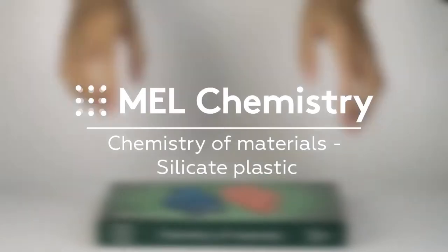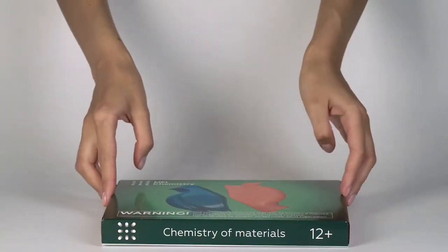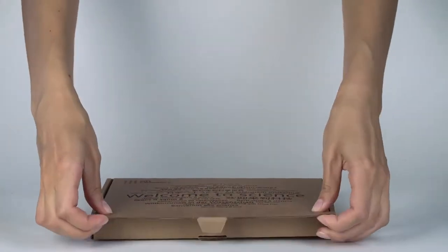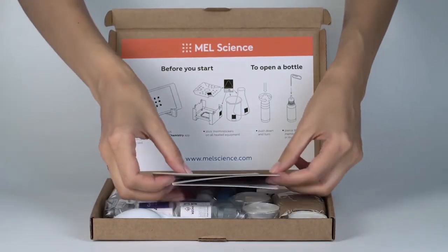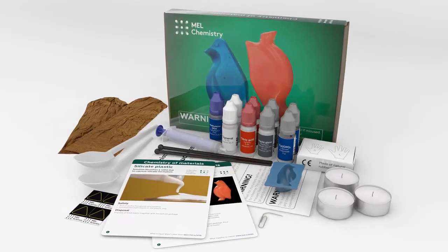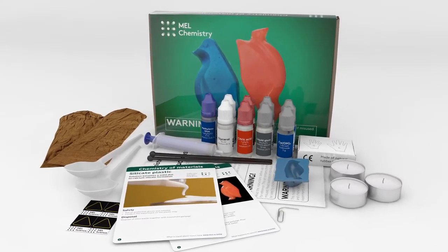Welcome to the wonderful world of chemistry. Today, with the help of Chemistry of Materials set from MEL Chemistry, you will produce a liquid which solidifies when pouring it from one cup to another.